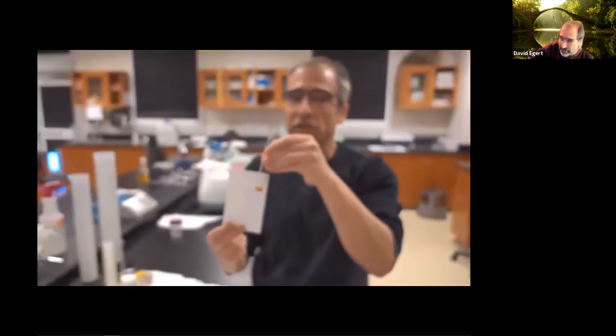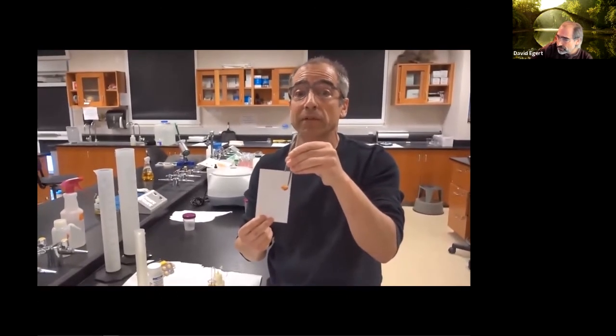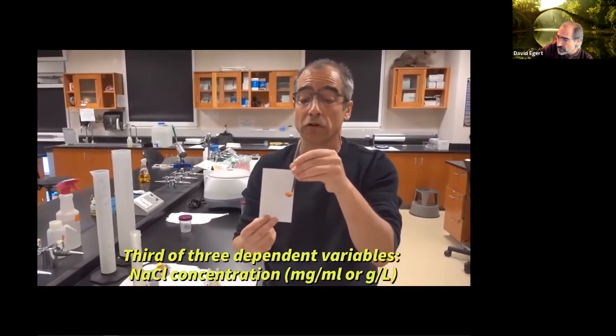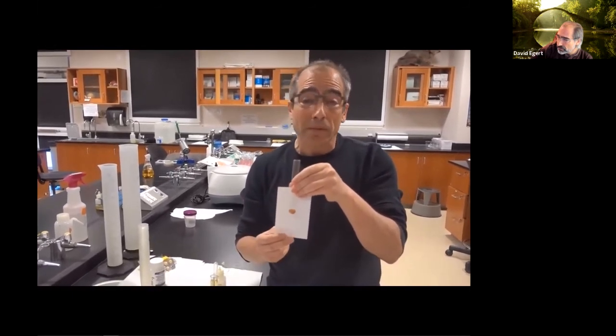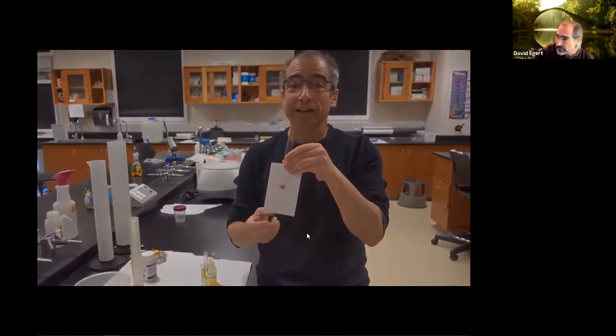It took 14 drops. So that would mean I've got about 14 milligrams of sodium chloride per milliliter, or 14 grams per liter, in my urine, which probably makes sense given that I'm probably pretty dehydrated being in group 3.